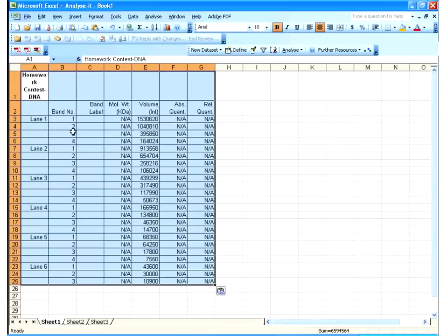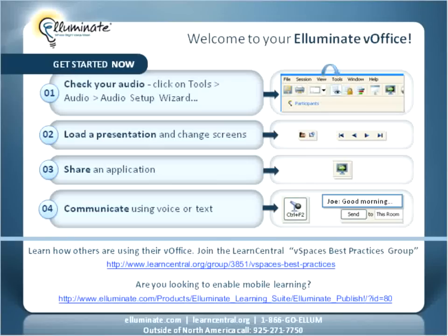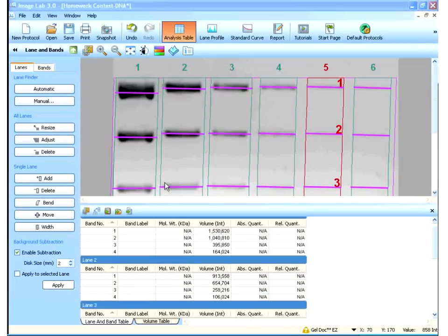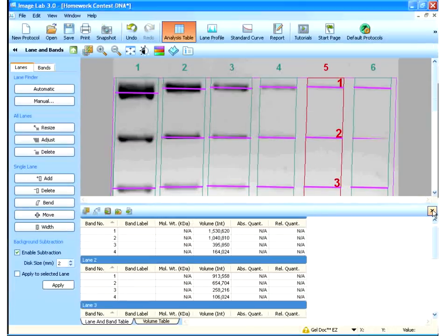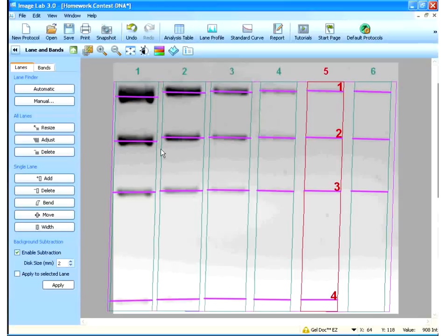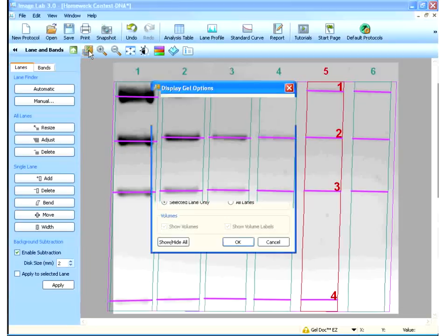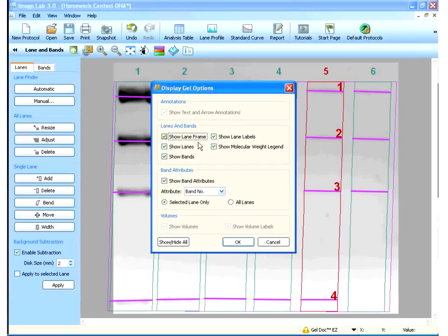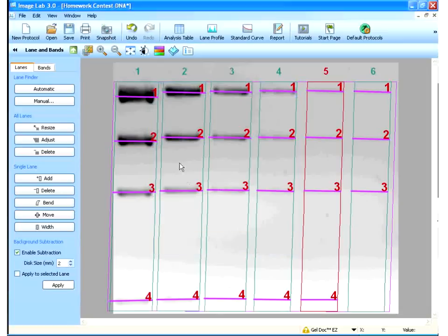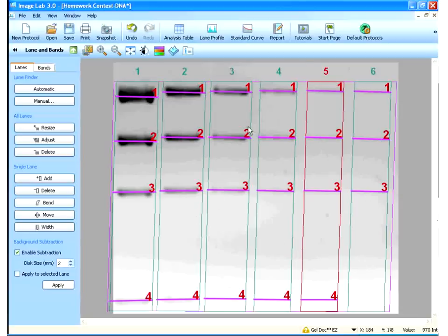If I go back to Image Lab. And, I click off my analysis table. I can go to this tool here at the top. These are all sort of my imaging tools. I click here. I like to show band number. But, for all the lanes. And, now what I've created is a map of my gel by lane number. And, by band number within the lane.